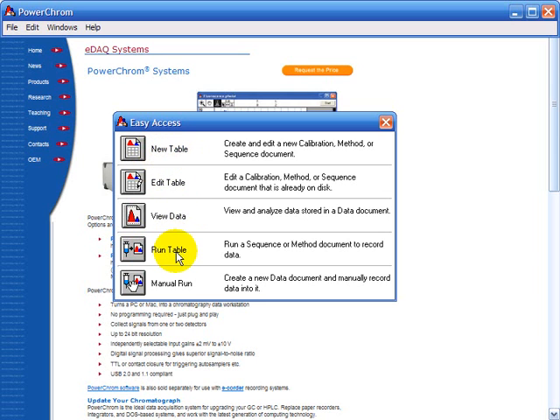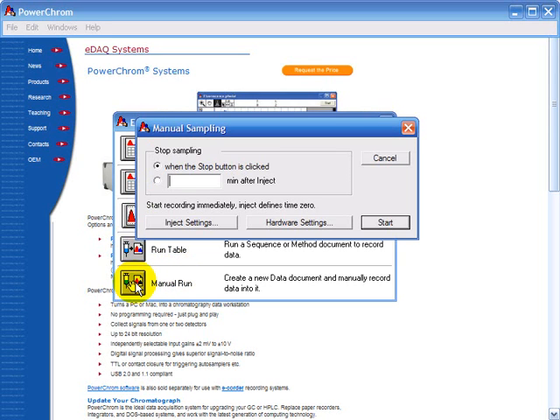But the simplest thing to start off with is to do a manual run. This manual sampling box has many options which I'll cover in a different screencast. For the moment I'm just going to click start.